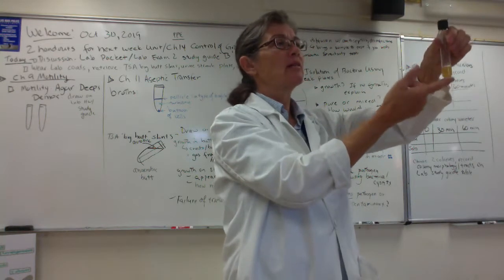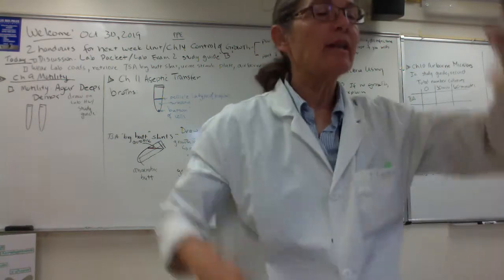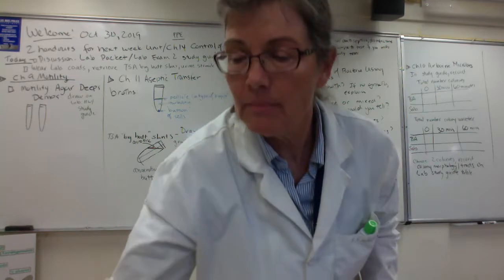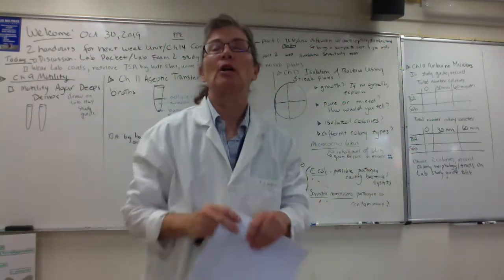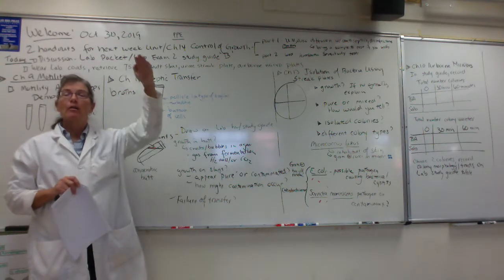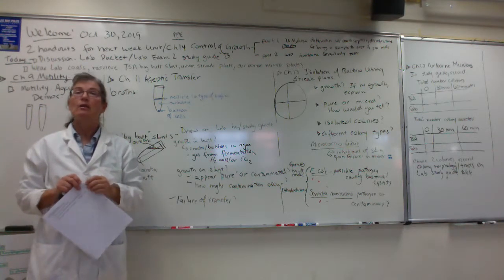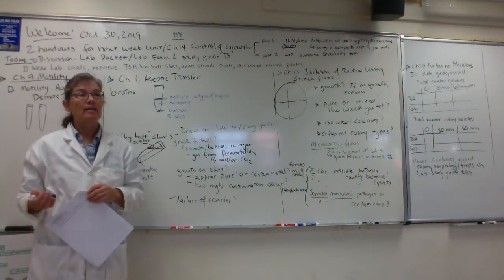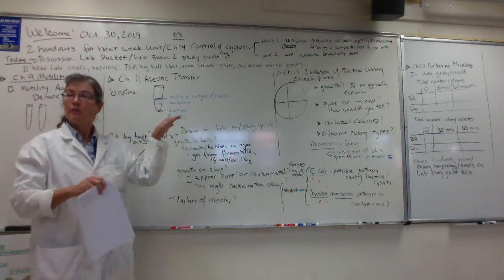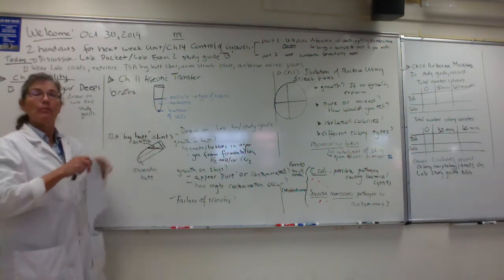So a button of cells at the bottom is also an indicator that cells are present, that you had growth. The last thing, folks, and these little guys didn't do it, but some bacteria, especially if they're strict or obligate aerobes, can form a type of biofilm at the air-broth interface. And that layer of cells is called a pellicle. It makes sense. It's a survival advantage. If you can use aerobic respiration, and you're living in the broth, where will the highest concentration of oxygen be? It's right at the air-broth interface, right?